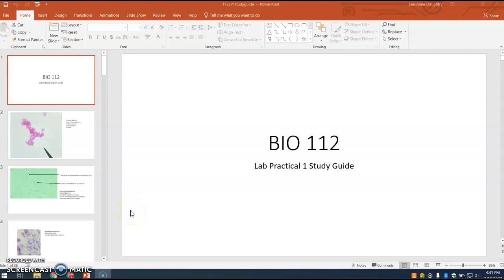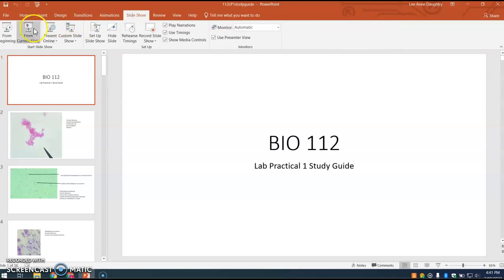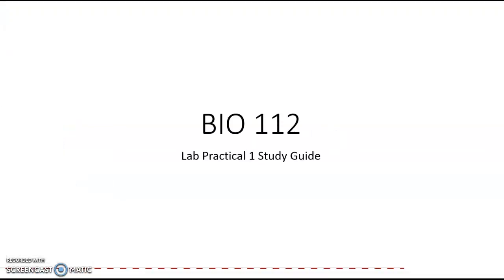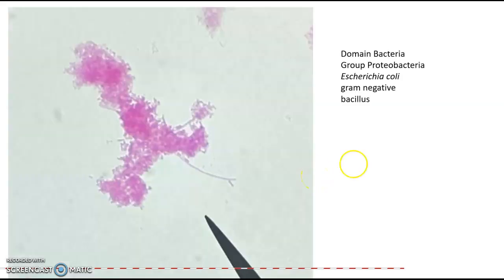This is going to be a review for Lab Practical 1, the parts on bacteria and Protista. Although this slideshow actually contains fungi and plants as well, I'm just going to go over the bacteria and the Protista in this recording anyway.